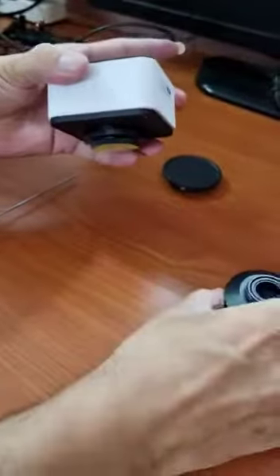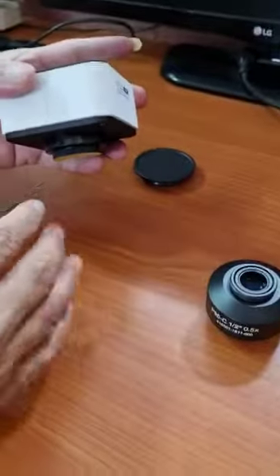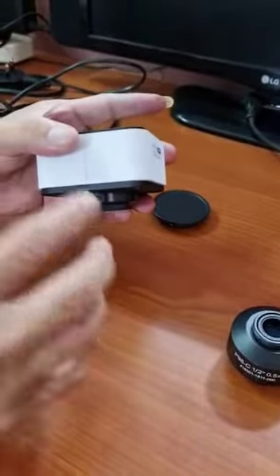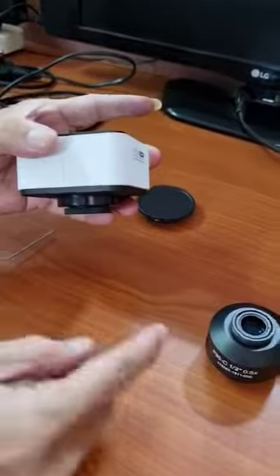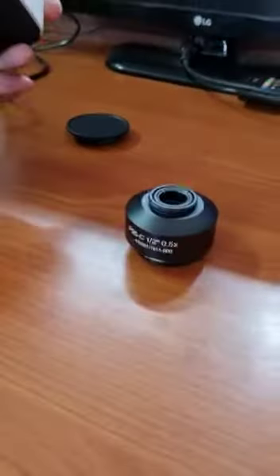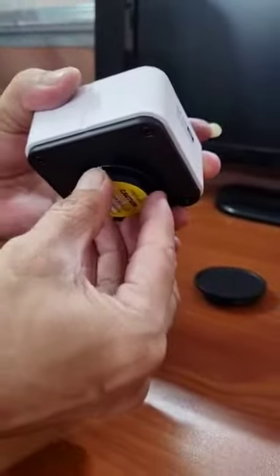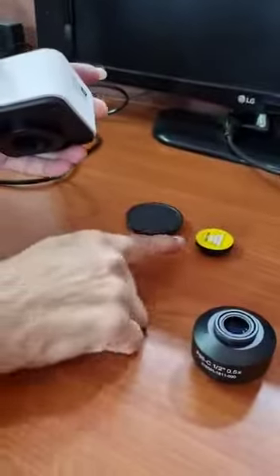Now hold the camera in your left hand. It is always recommended and advisable that you hold the camera as close to the table as possible, so that even an accidental fall will not damage your camera or the C-mount adapter. Remove the transit dust cap that comes fitted on the camera.